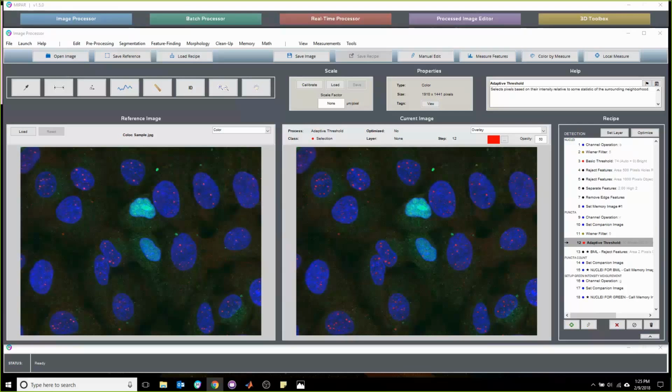Yeah, of course. There's not much more I can add here. Everything was pretty well covered. I used it for quantification of titanium microstructure, both SEM images and optical images. I'm looking for both segmenting out different phases, which are pretty clearly a two-phase microstructure, as well as quantifying different types of morphologies.